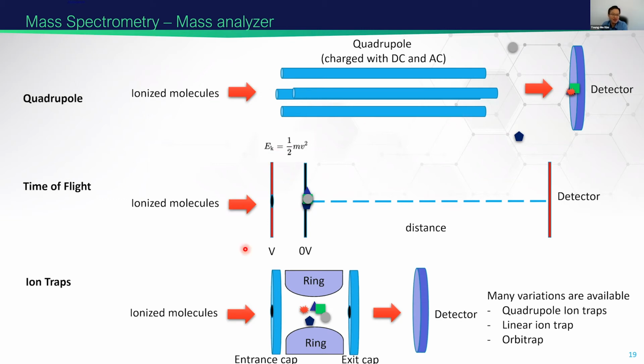And the second thing is time of flight. It measures in real time how long the metabolites flew from this point to the detector. This measurement is based on a pulse. So when we accelerate metabolites at this point, and then we don't give any electric field, they keep flying with their energy. Based on this, the lighter molecules reach the detector early, and the heavy molecules reach later. So we can measure the time difference, and then we can show them as m/z values.